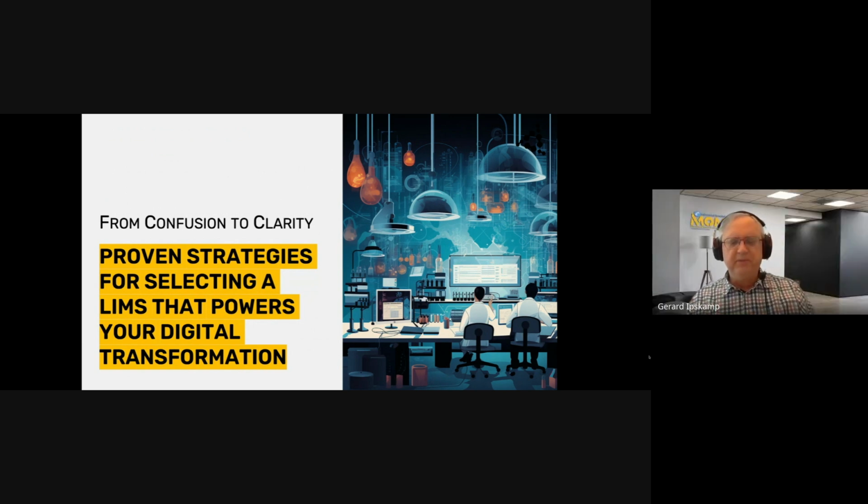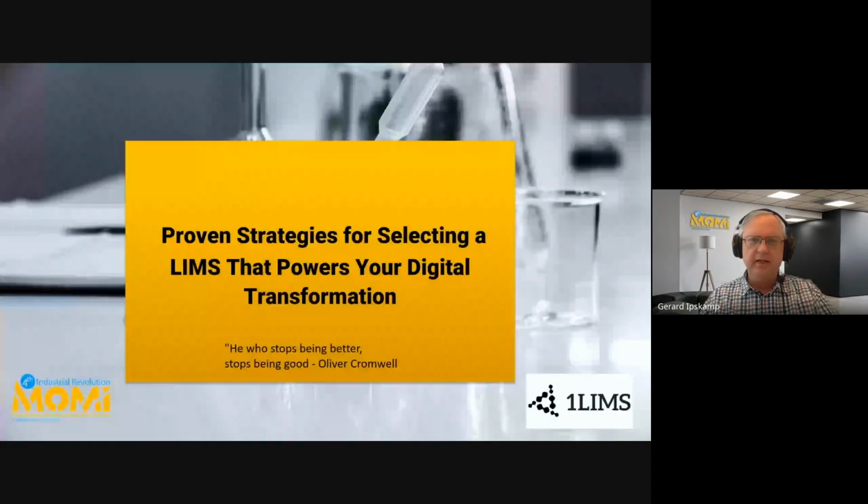Okay, thank you, Philip, for the nice introduction. Let me share my screen, of course. In the meantime, everybody, good morning, good afternoon, good evening, wherever you are. I'm going to talk 35 minutes about mainly selecting a good LIMS.